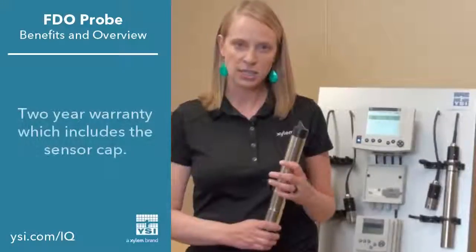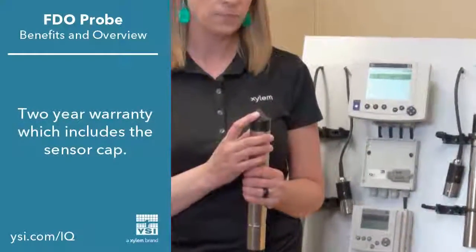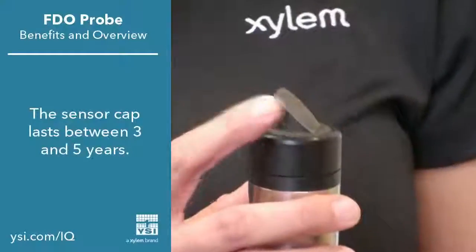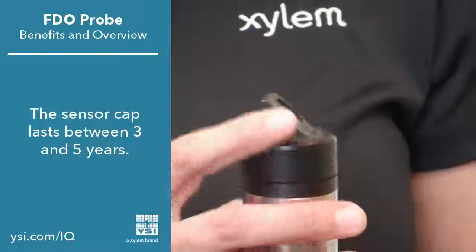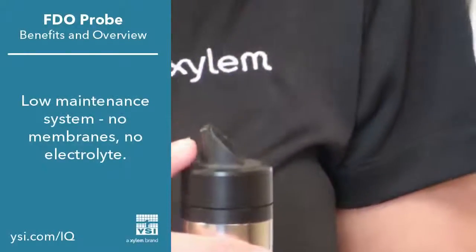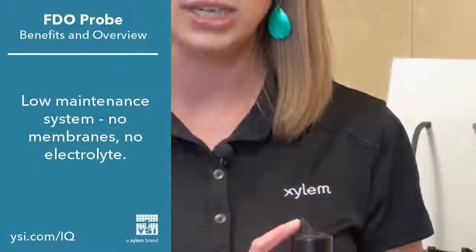The FDO probe comes with a two-year warranty. That two-year warranty extends to the sensor cap as well. The optical sensor cap will last 3-5 years and only needs to be replaced when necessary. So you no longer have to replace membranes frequently and change out electrolyte. This really minimizes the amount of maintenance required to get good dissolved oxygen readings.